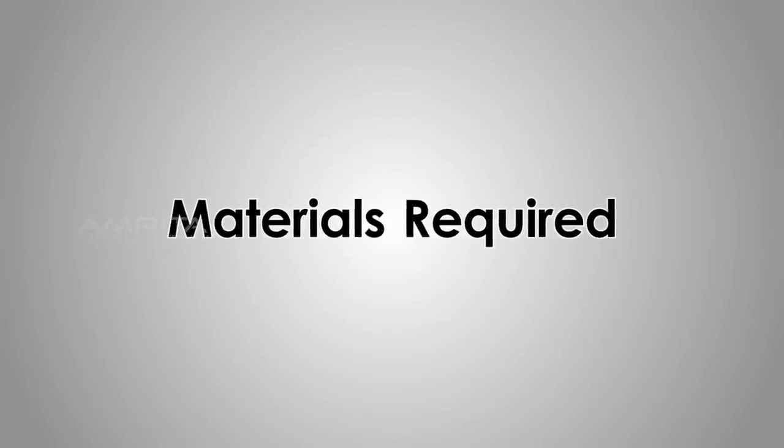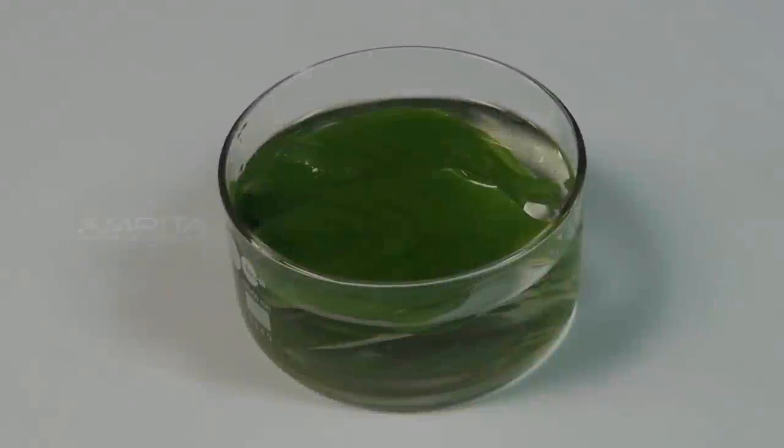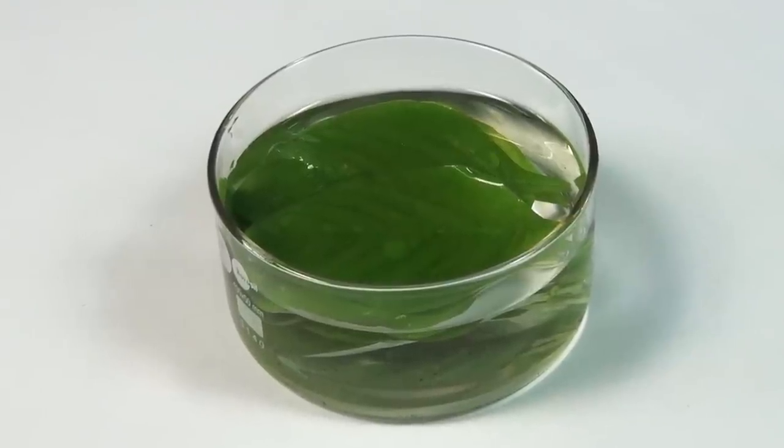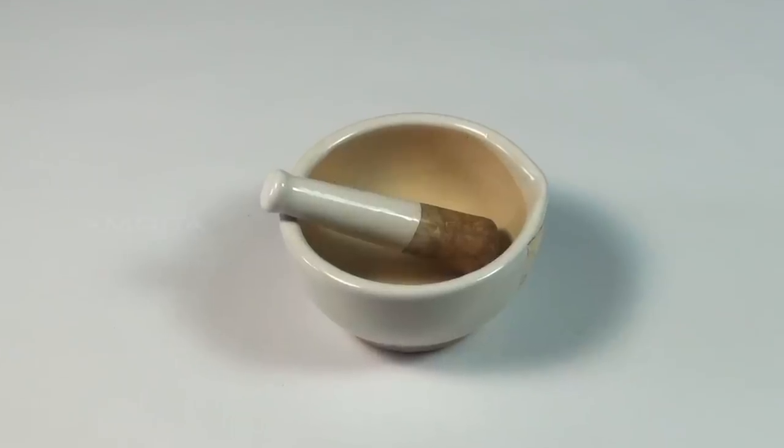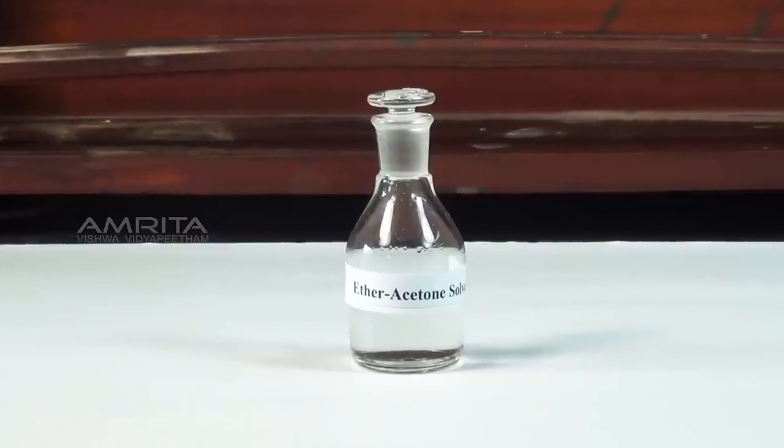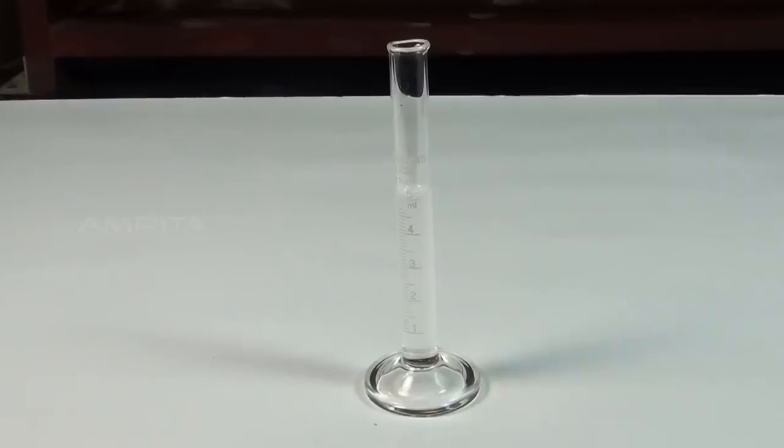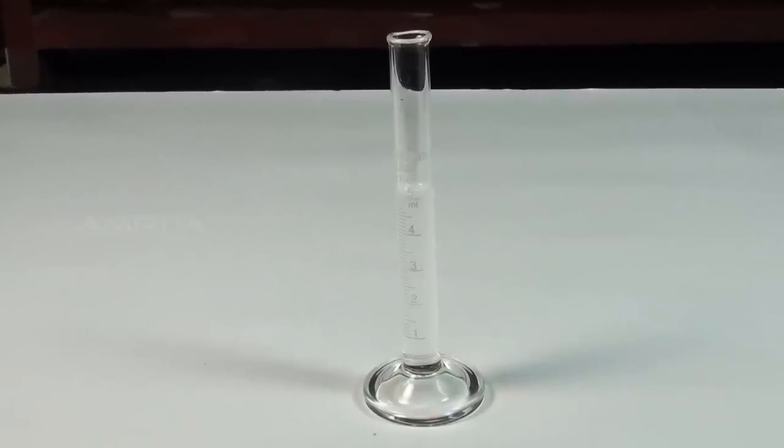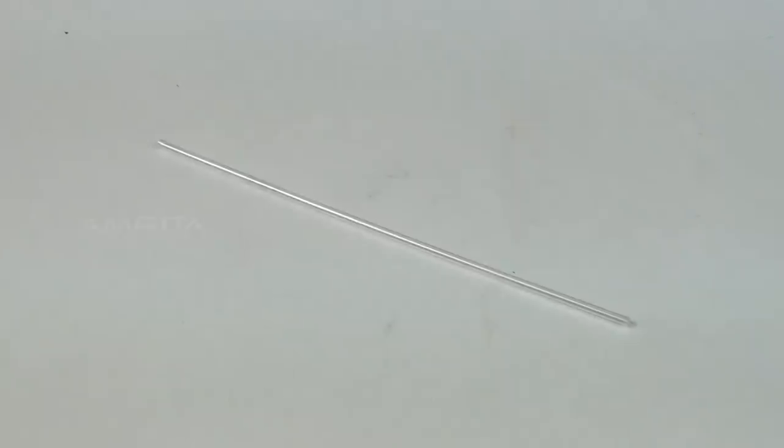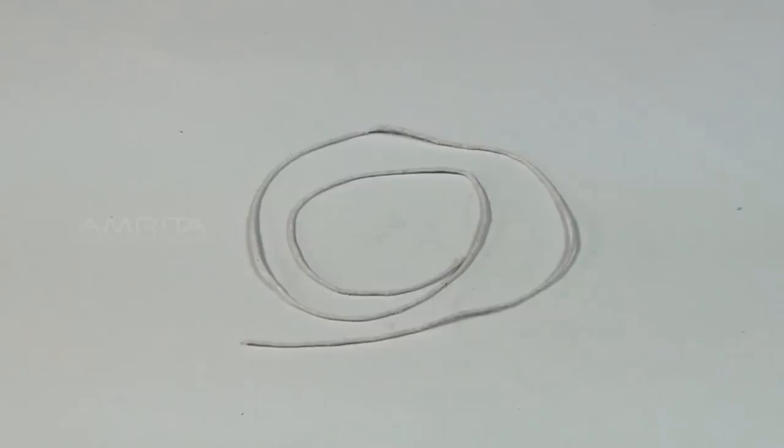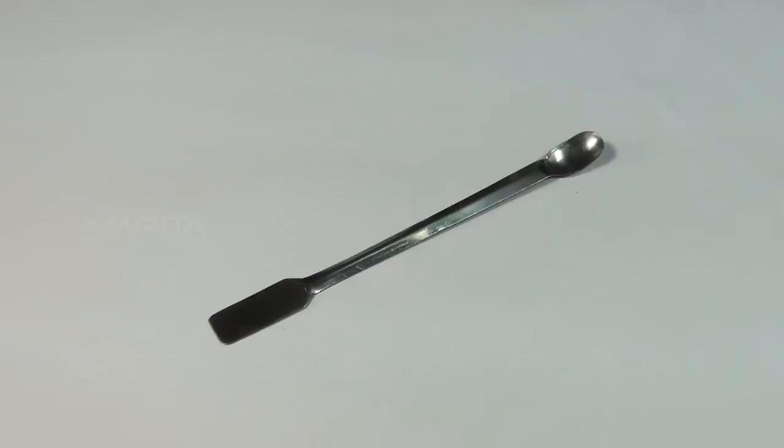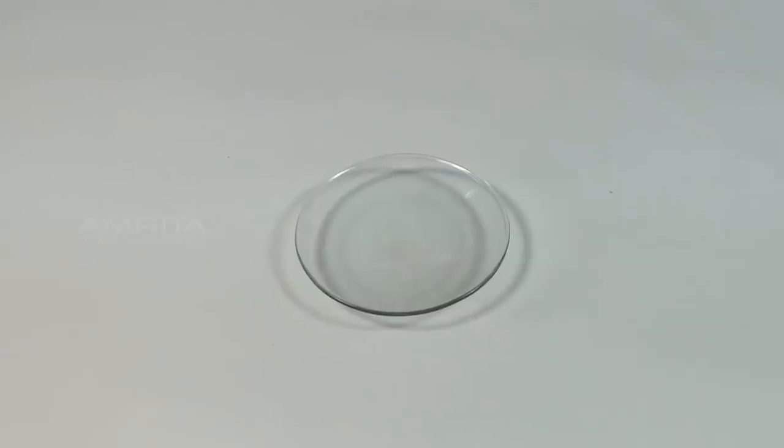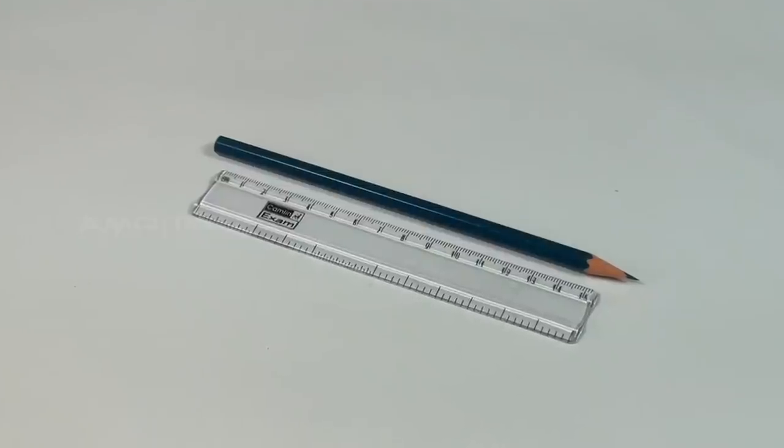Materials required: fresh spinach leaves, filter paper strips, chromatography chamber, mortar and pestle, ether acetone solvent, measuring cylinder containing 5ml acetone, capillary tube, thread, stapler, scissors, spatula, watch glass, scale and a pencil.